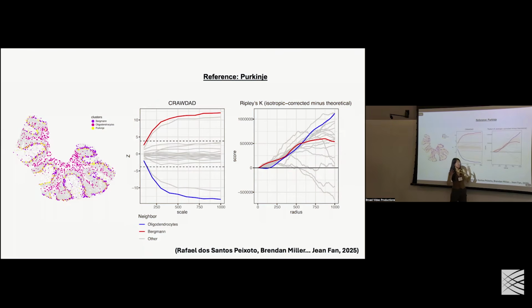So this comes down to, again, what is the real appropriate null distribution here? You could say that the global background is appropriate if we want to ask, are Purkinje cells and oligodendrocytes indeed present in the tissue versus outside the tissue. So there is a realm in which you could say that at the end of the day, these are statistics. They're calculating something.